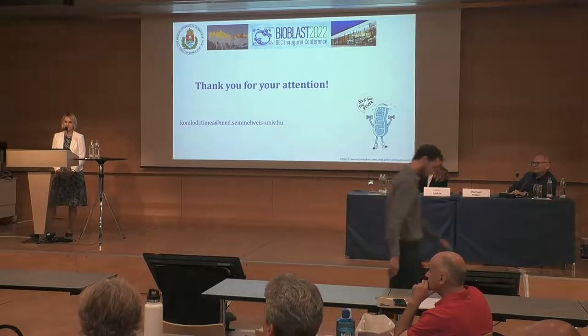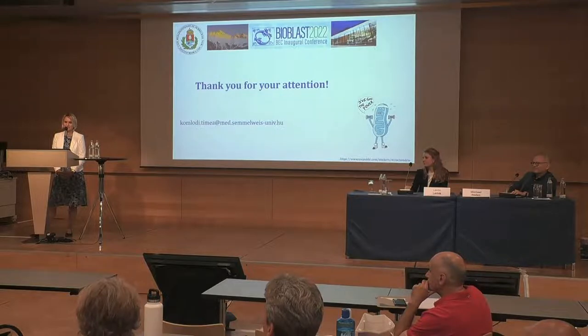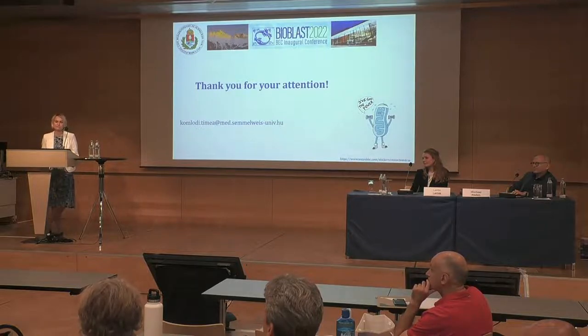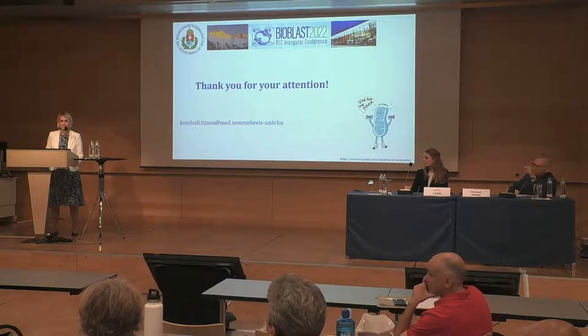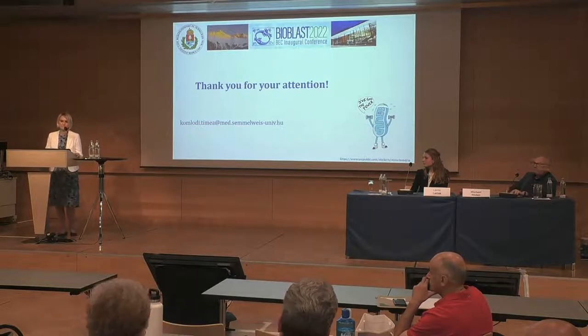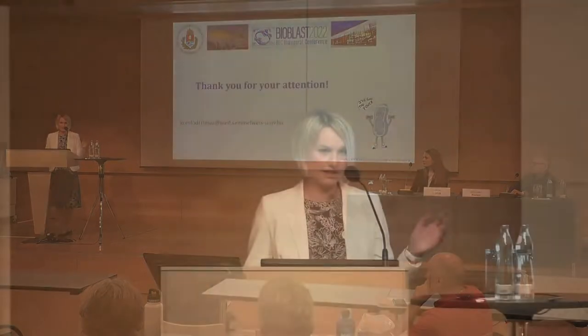Thank you for making us aware that delta psi is not everything in the proton motive force. Now, you published with us in BEC the oxygen dependence of hydrogen peroxide production, and we have a joint paper in preparation looking at the relationship to delta psi and hydrogen peroxide flux. So how did you control for oxygen in your measurements here? Was it always at comparable oxygen levels? Because the oxygen dependence of hydrogen peroxide flux, it's your work. So how does this now relate to your present comparison, delta pH versus delta psi?